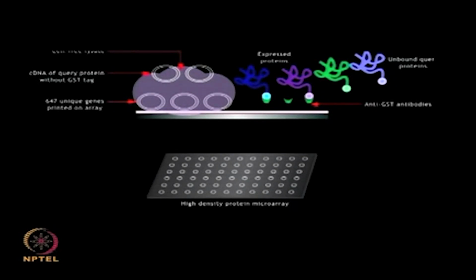After addition of the cell-free expression based system, proteins containing GST tag were synthesized and bound onto the capture antibody.